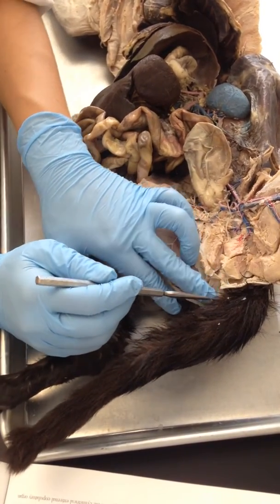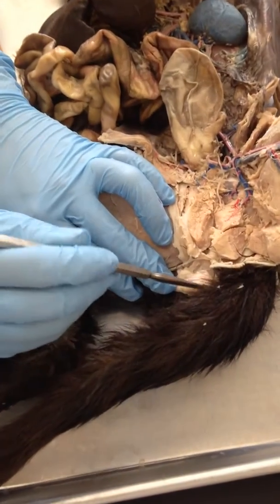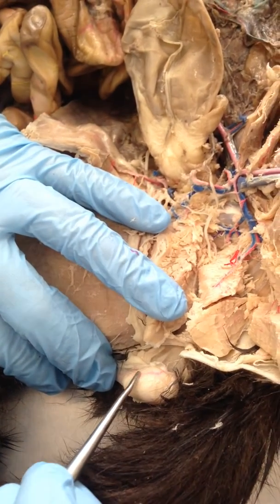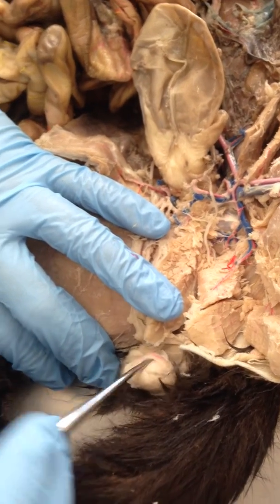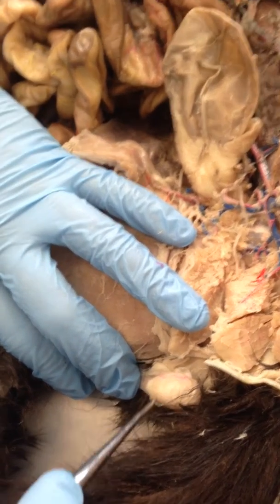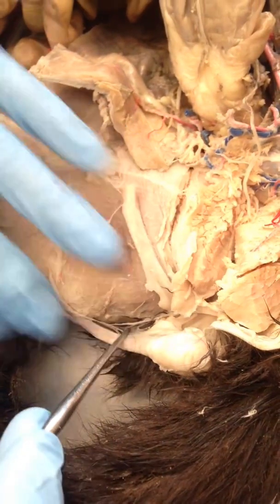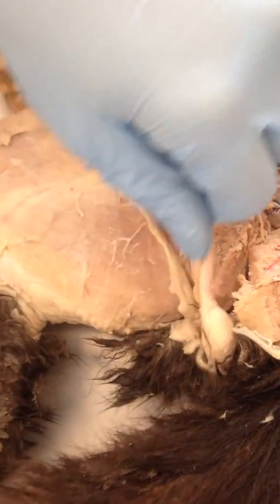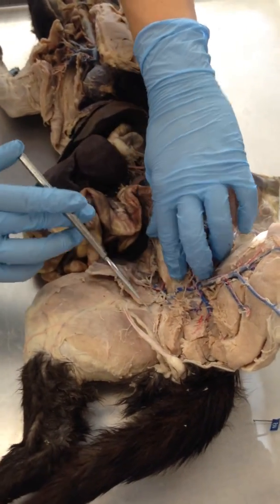Okay, that's fine. And then the epididymis is what surrounds the testis. So you have the testis proper and then the epididymis. You can see it wrapping around the testis. So is that this? Yes, the testis proper is right here. This is epididymis. This is the head and the tail of the epididymis, and then way down here the vas begins. The vas deferens travels this way, all the way out. Okay. Perfect. And this is the fundus, and then it goes down into the urethra, which is underneath.